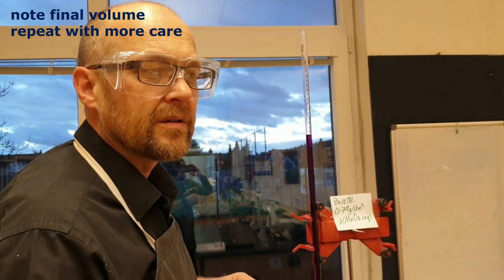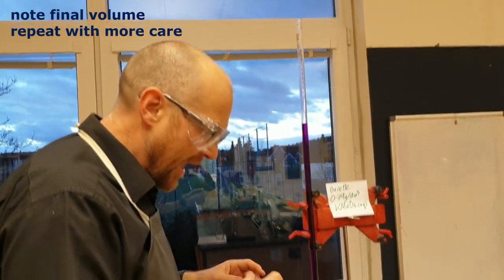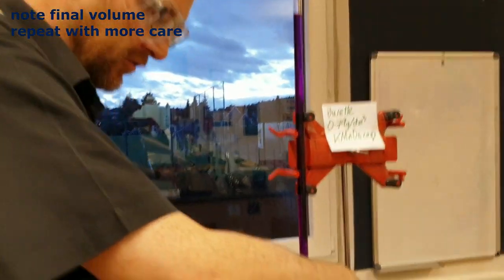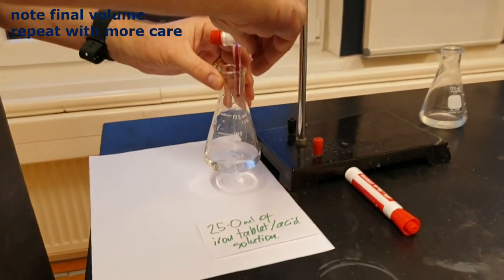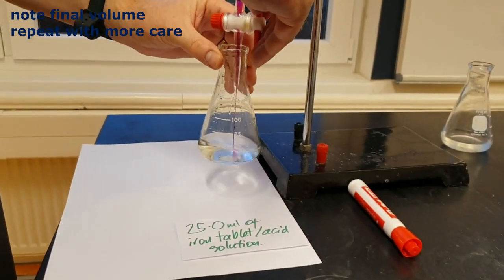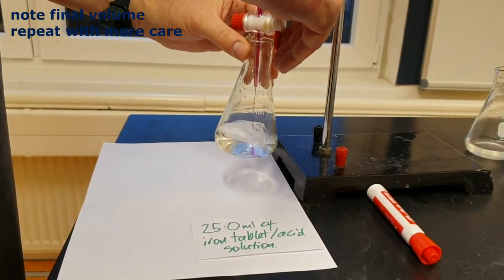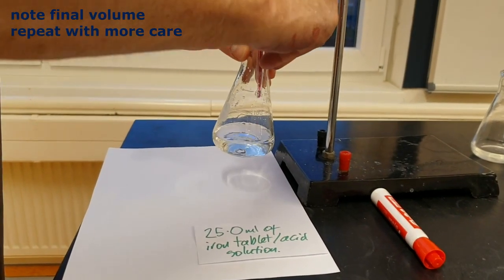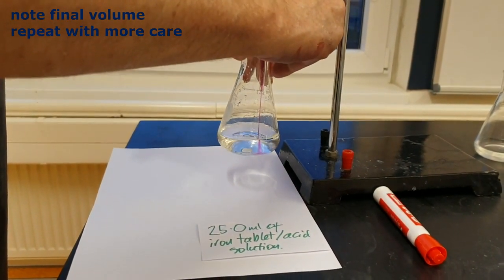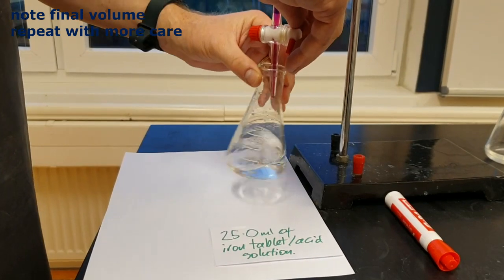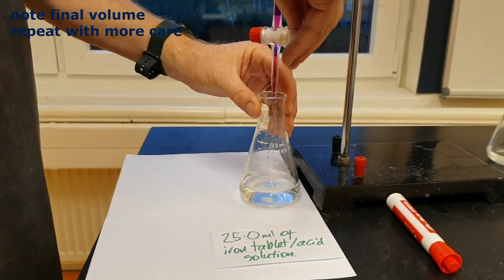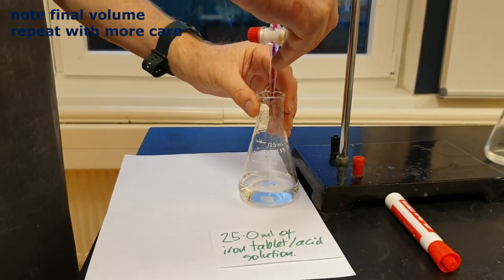Okay, second titration. Well, I think I want to stop at about after I've added 10 this time. And then do it much slower. So let's add 10. So that's 10 added. And now I'm going to add drop wise. I should be able to catch it on just one drop.